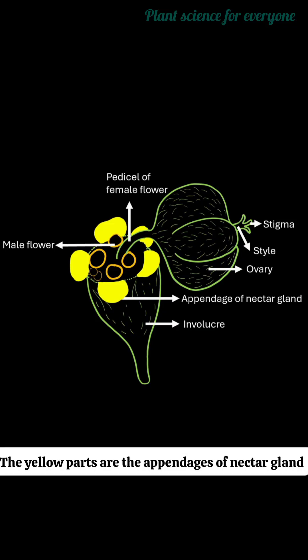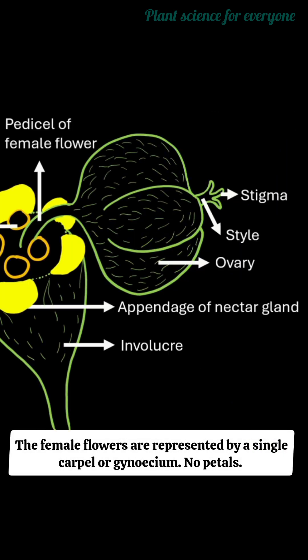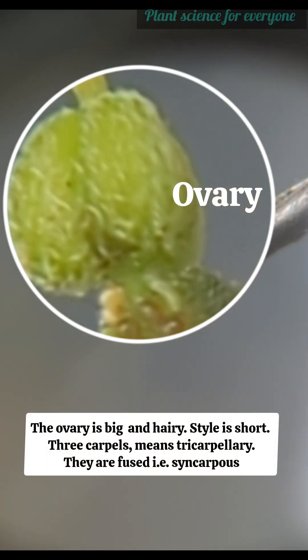This is a single cyathium having many flowers in it. The lower part is a cup-shaped involucre, and the yellow parts are the appendages of the nectar gland. The flowers are unisexual. Male flowers are represented by a stamen only — no petals. The female flowers are represented by a single carpel or gynoecium — no petals.